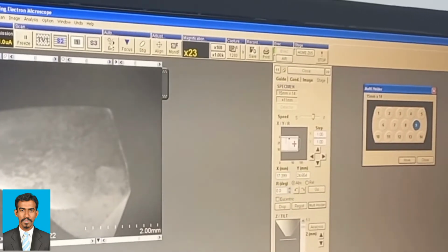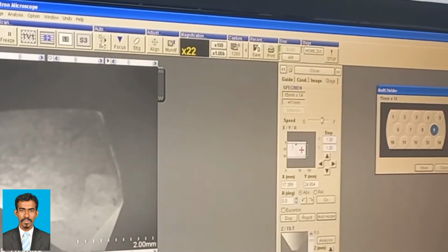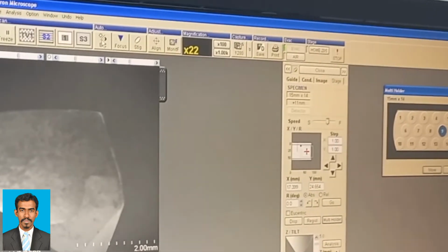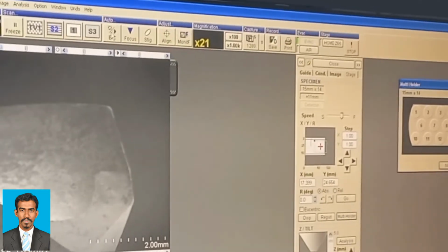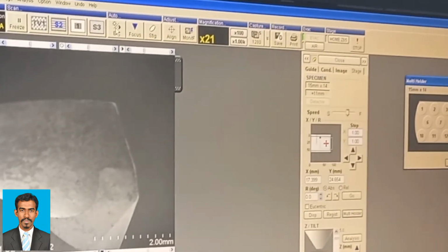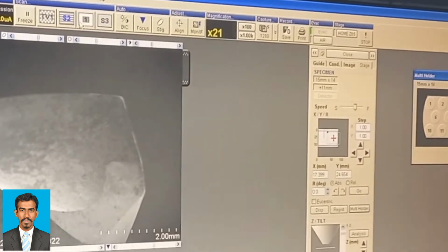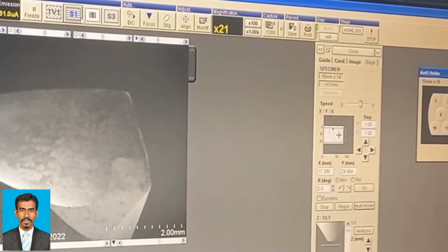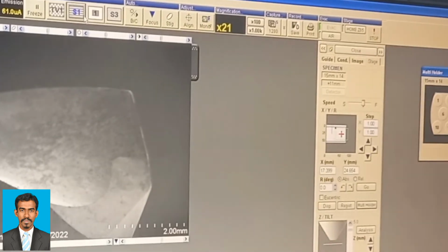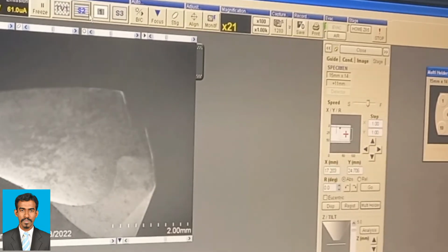When magnification is lower than 5000x, coarse focus is carried out, and fine focus is carried out at magnifications above 5000x. Fine focus works correctly under conditions where the image is not clear but visible. The result of autofocus depends on the surface structure of the specimen. When there is little or no surface detail on the specimen, or when the specimen is charged, autofocus will not operate properly.